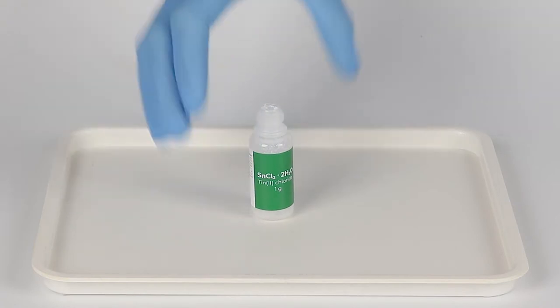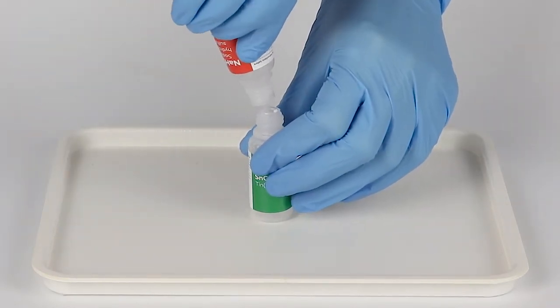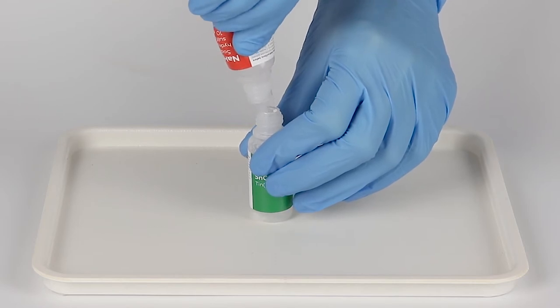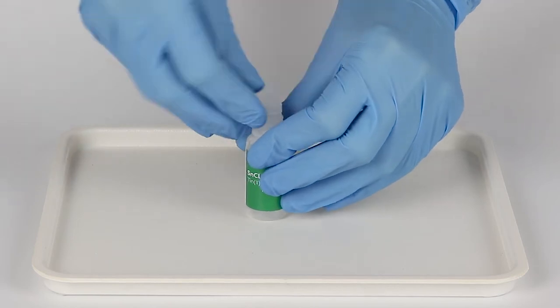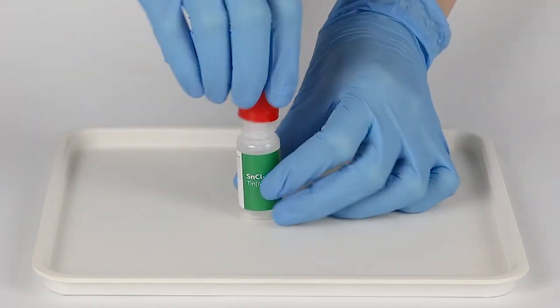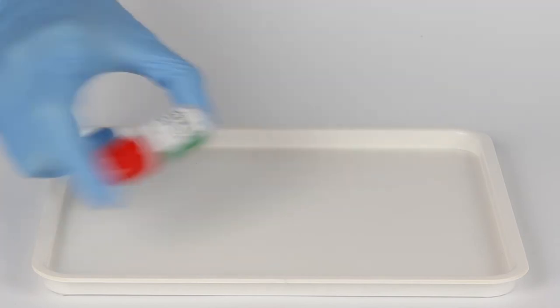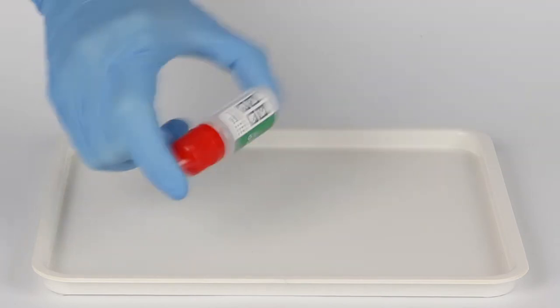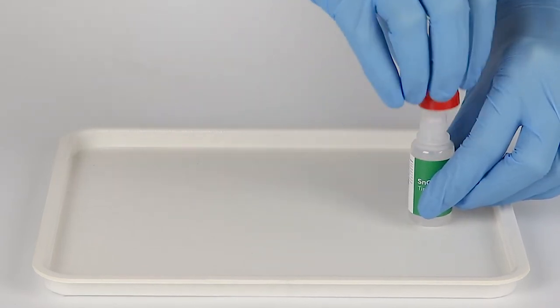Open the bottle of tin chloride and pour one bottle of sodium hydrogen sulfate solution into it. Securely insert the tip and close the bottle using the red cap. As an alternative, you can use the white cap from the bottle of sodium hydrogen sulfate solution. Shake the bottle well to mix the contents.